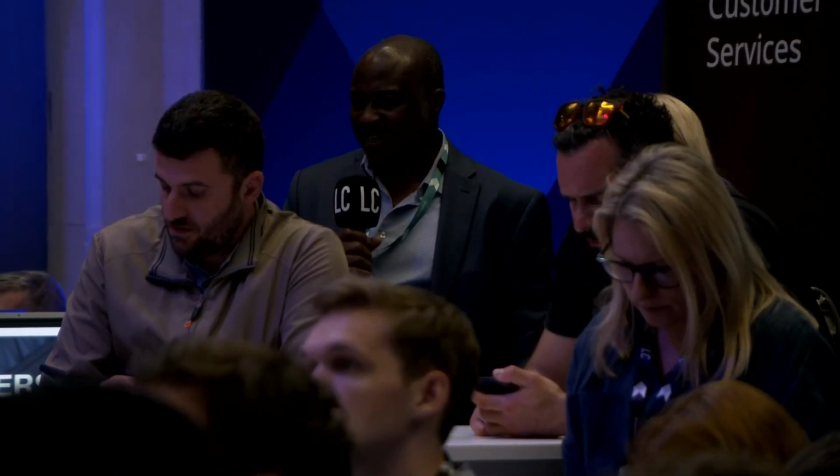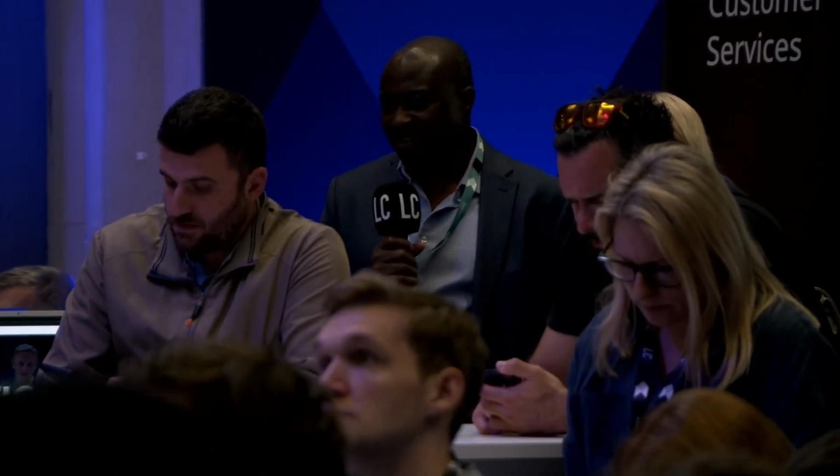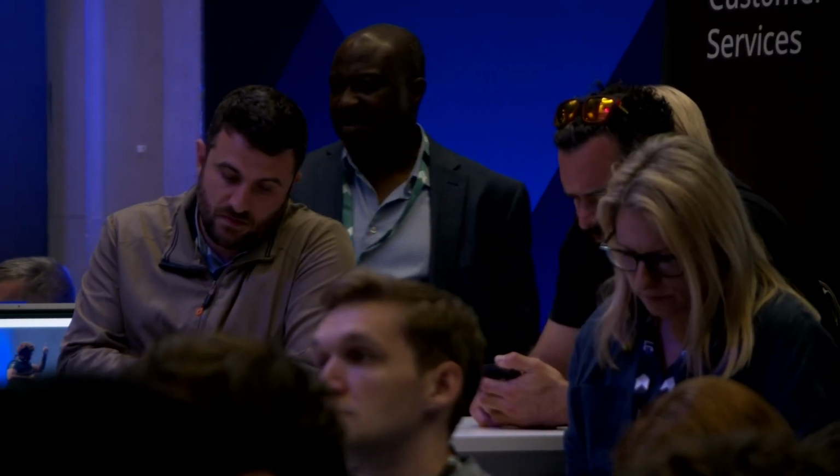More questions? Someone in the back. So this is just a general question. Does it matter what size of reference you're using for your adaptive sampling in terms of the output of your data? I'm probably not the best person to ask, because I tend to ignore the recommendations and just do what I think is going to work.